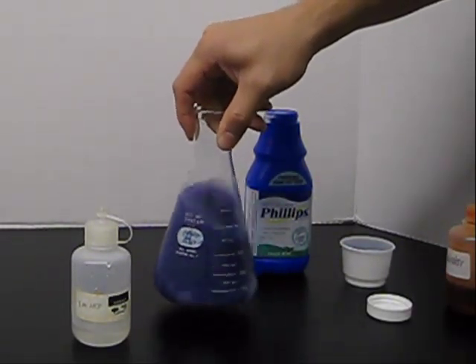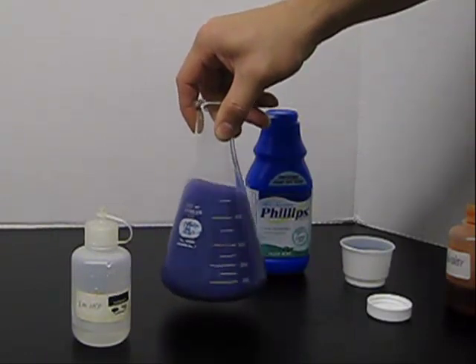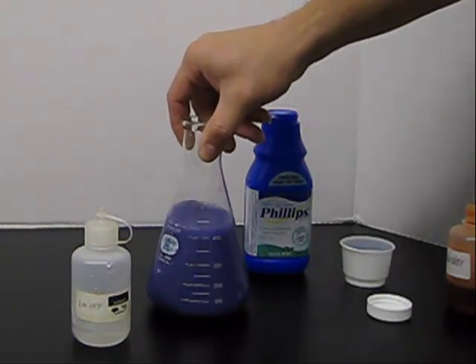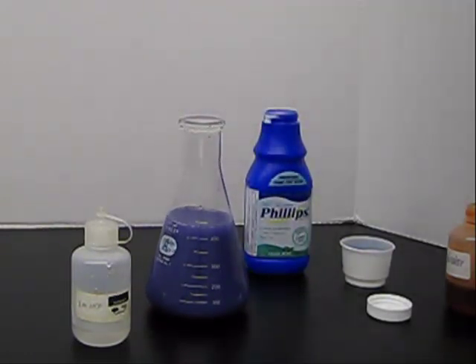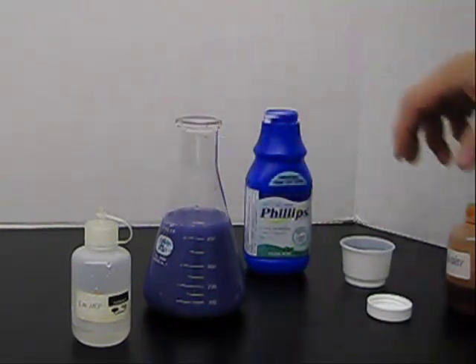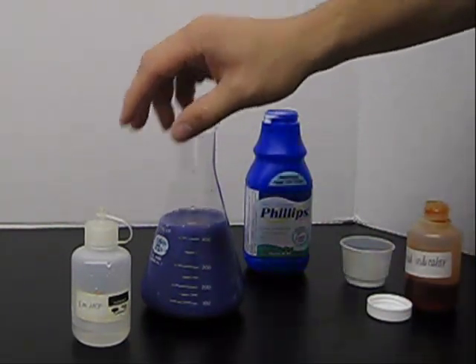And we are just going to stir it. And stirring it will get everything mixed up, and you will see that it is cloudy and that is some milk of magnesia that has not dissolved yet. And the blue color is because it is a base.